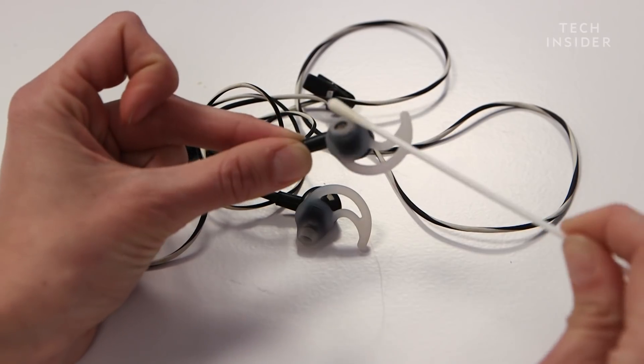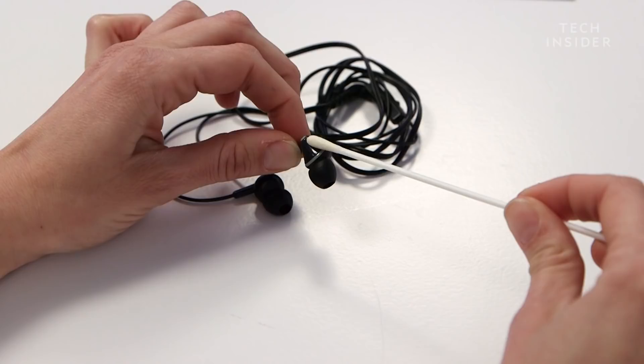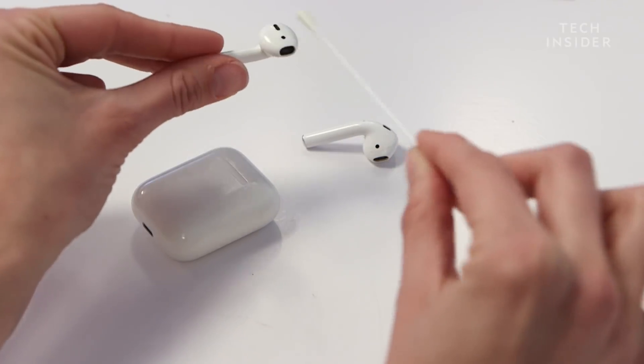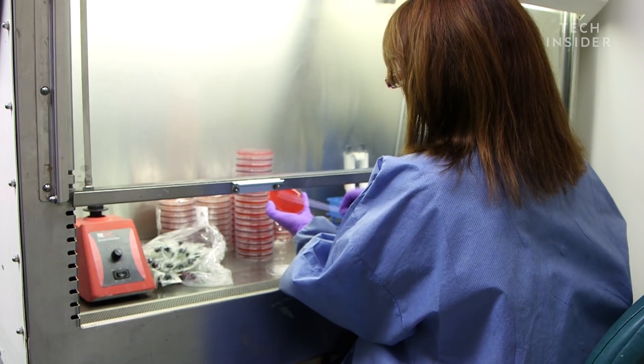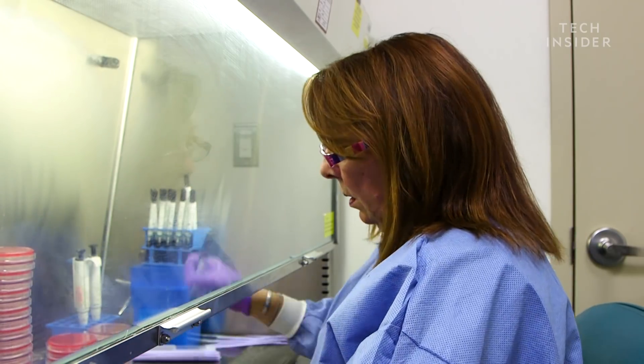To see how gross earbuds really are, we swabbed 22 pairs to get tested for bacteria. We also swabbed two over-ear headphones to see if they were any different. And then we took the swabs to Columbia's microbiology lab. What I'm going to do is take those swabs and inoculate them onto agar plates. Agar plates are what we use to grow bacteria and yeast and sometimes mold.